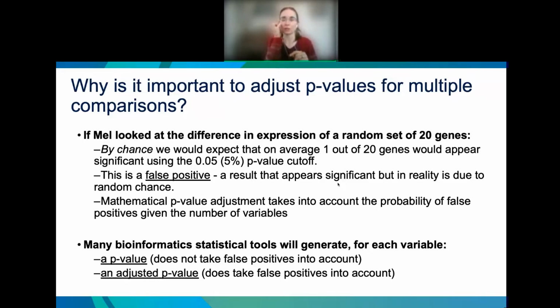So to bring this into the realm we're talking about in gene expression data, we're going to run DESeq2. DESeq2 is set up to perform a hypothesis test between the groups that you give it, for each gene, asking the question, is this gene statistically differentially expressed, trying to disprove that null hypothesis. So for each gene, we get a p-value and an adjusted p.